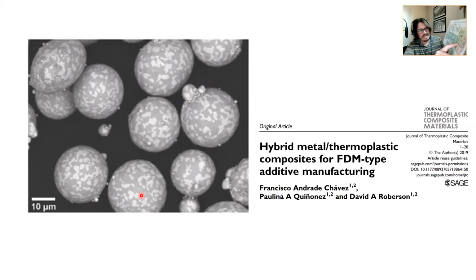But anyway, tin, so it says for plated food cans on my child's periodic table, and then bismuth used in fire sprinklers. I didn't know that till I stared at this periodic table. And so tin is element number 50, so it has a Z number of 50. And compared to bismuth, which has a Z number of 83, bismuth is a bigger atom, so the backscattered electrons are going to have more kinetic energy when they come around the nucleus, okay? And so the brighter phase is the bismuth-rich phase. The darker phase is the tin phase.